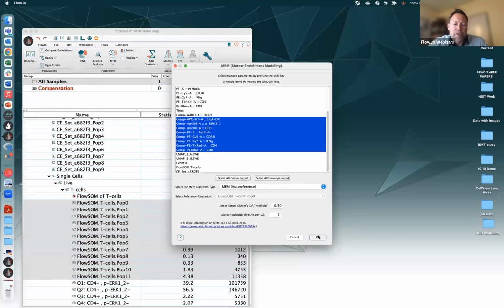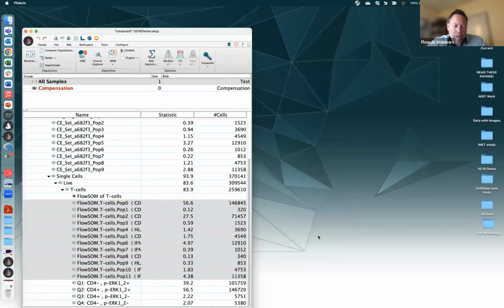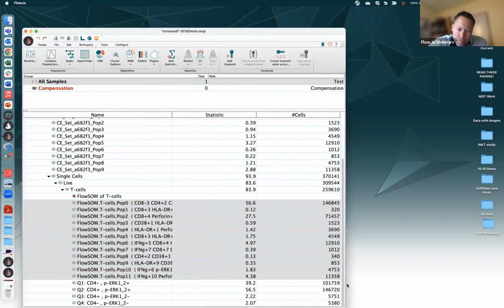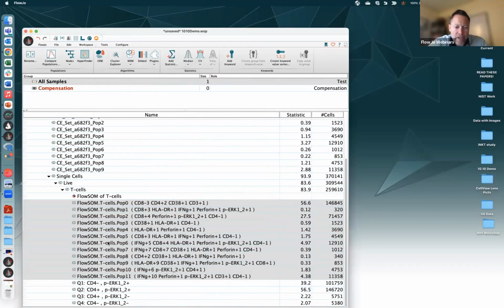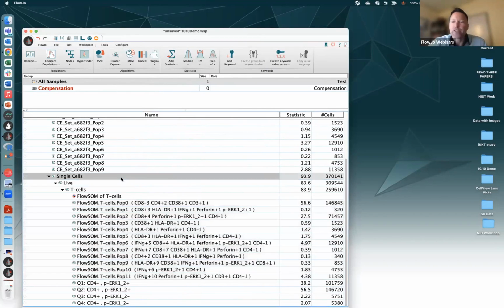So the MEM algorithm is going to do its thing. And in a moment, we will end up with MEM scores appended to the names of all these data files. So we can say things like, what makes population? I didn't show HyperFinder either. Why didn't I write that down on my list? All right, no, I did. It was just on the left side.